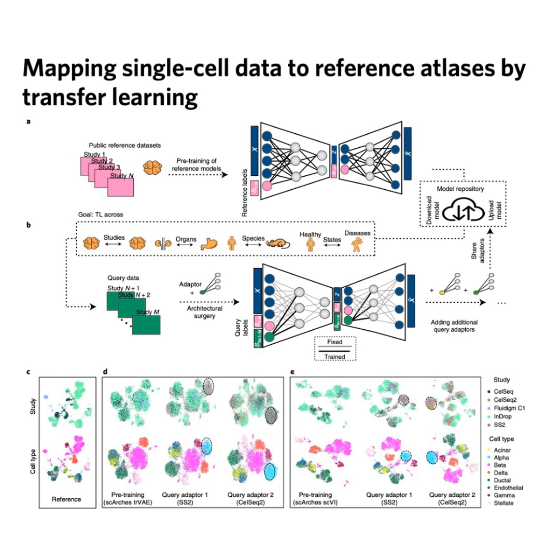Exactly. The frozen part of the model handled the basic cell identities, the little adapters handled the new technical batch effect, and the unique disease signature was just left alone, allowed to stand out. And what did it find? What did the final map look like? It was a huge success.